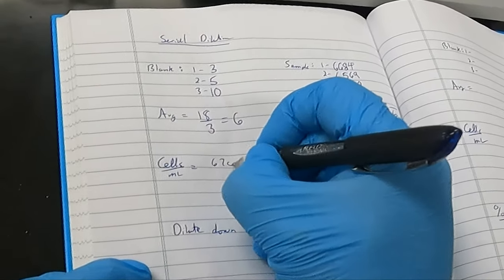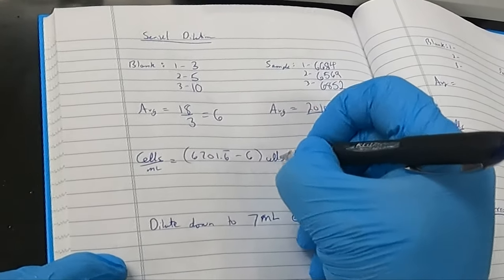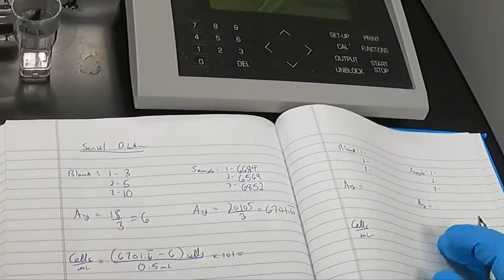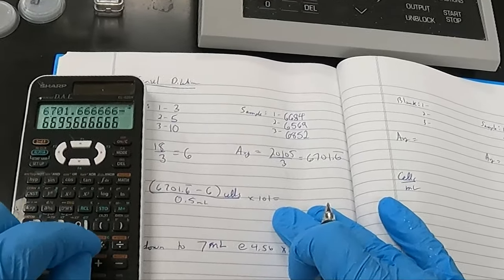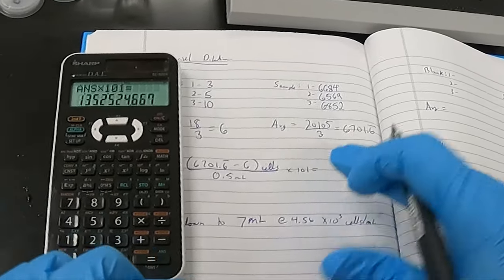We'll now calculate the concentration. Our average sample minus our average blank, this will represent cells. We divide by 0.5 mils, the volume drawn into the machine every run, and our dilution factor was 101. It's 101 because we added 0.2 mils of cells in 20 mils of solution. Work it all out.